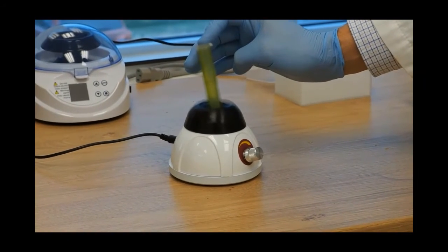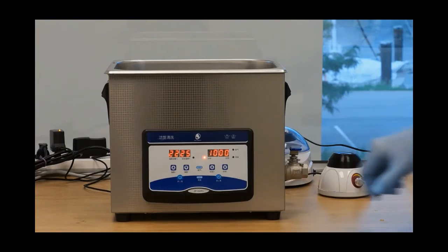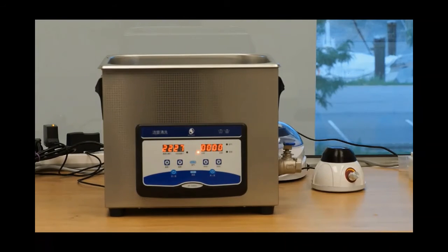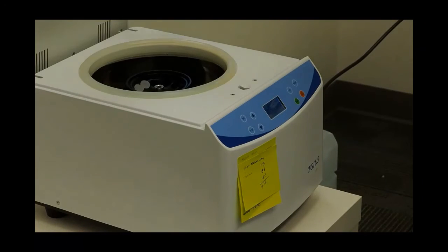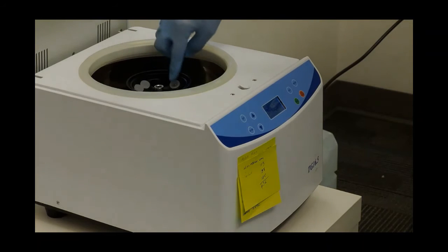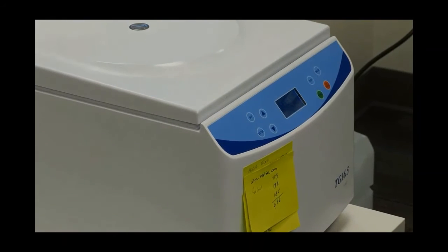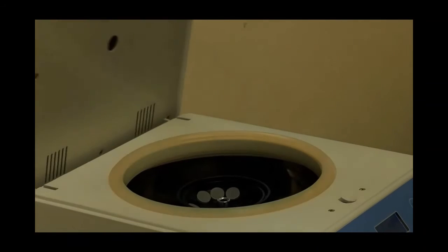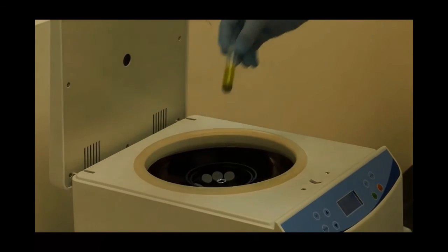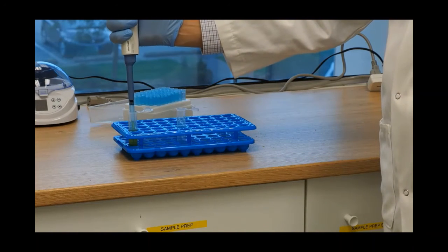In this stage, we will vortex the solution to release the cannabinoids and thoroughly mix it in the solution. We then place the test tube in the centrifuge to separate the supernatant and solid plant materials. The last step in preparing the sample is to accurately transfer and dilute the sample so that it can be analyzed in the instrument.